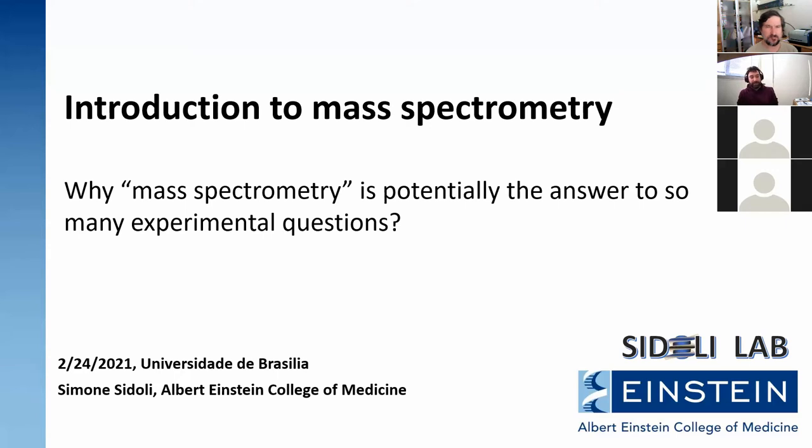The time that I want to spend with you, I want to help you by giving you an overview about how we do proteomics today, and then we'll go into a little bit more detail about the potential of the type of proteomic analysis that you can do, especially using mass spectrometry. So today is going to be mostly about how we identify and quantify proteins. Actually, let me give you a quick overview.